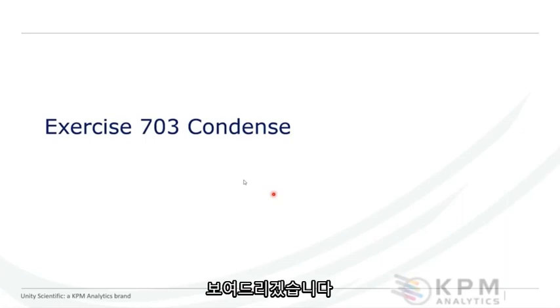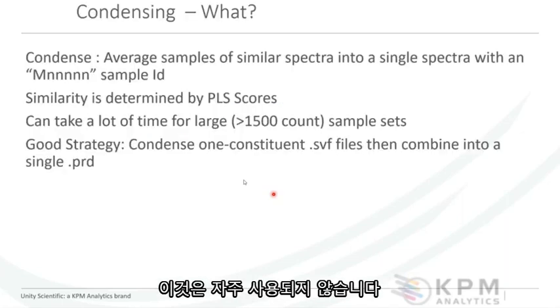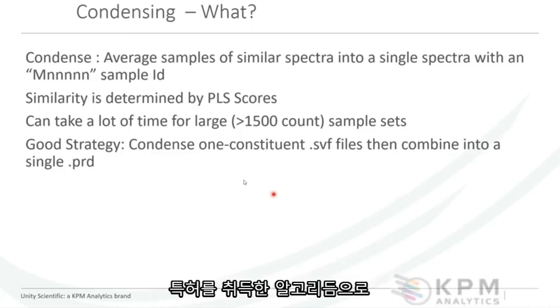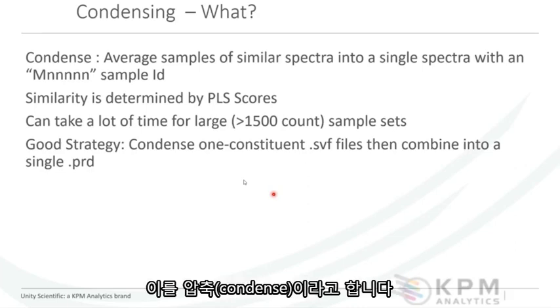The last one, I'm just going to have one slide on. This is also a technique. This is not used very often, but it's extremely valuable when you need it. And this is actually a patented algorithm that Unity Scientific has patented. So we call it condense.